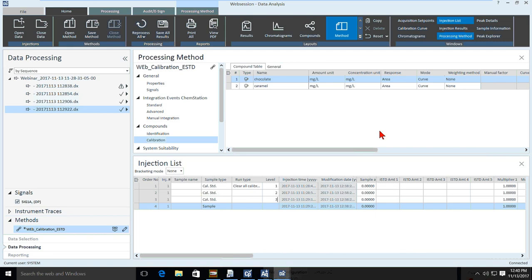Any questions at all so far about the calibration table? Thanks, Matt. No new questions at this time. Mia, any questions over the phone? No questions, ma'am.